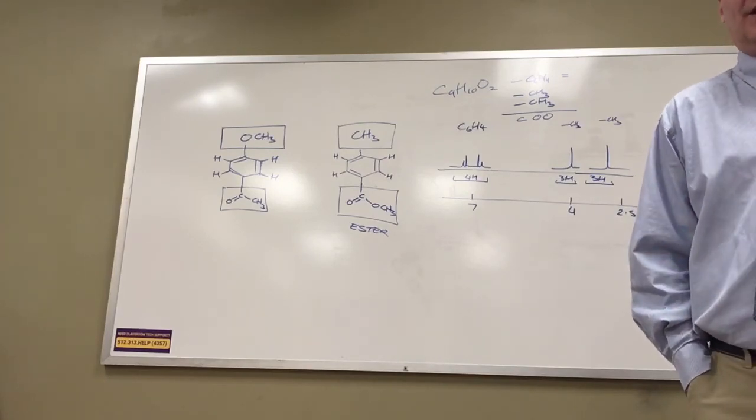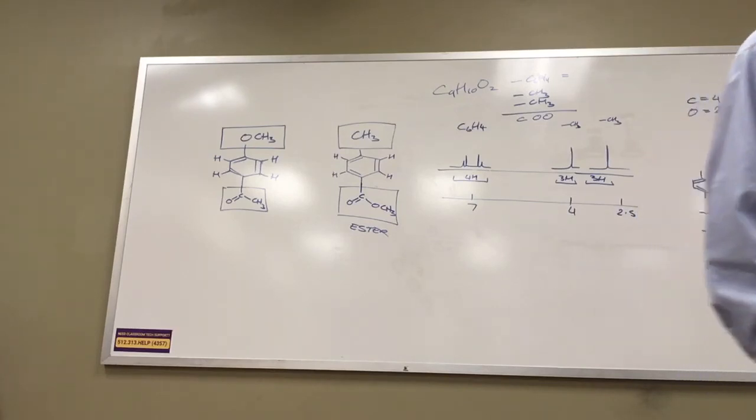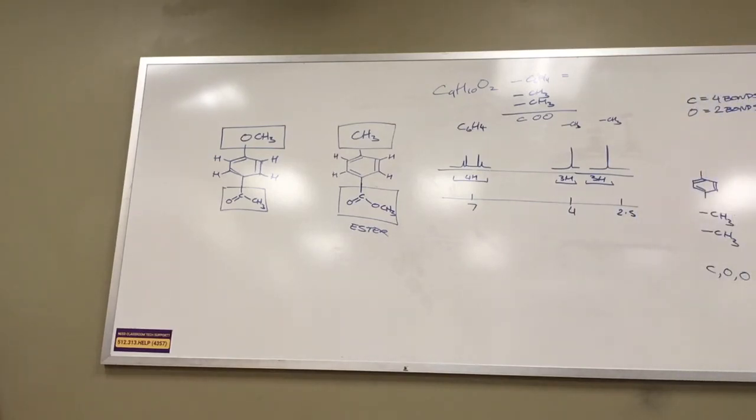We're going to look at some carbons, maybe some phosphorus, and then we're going to do it in 2 dimensions. And there's a couple of different two-dimensional techniques that are subtly different from one another and give very, very detailed information.